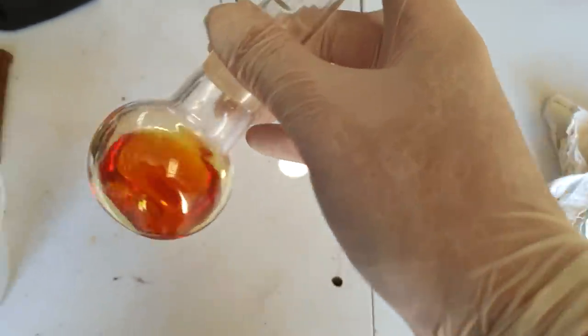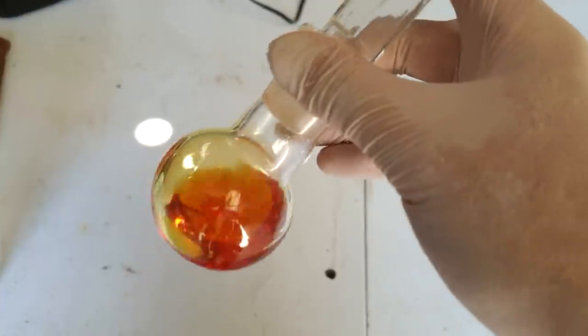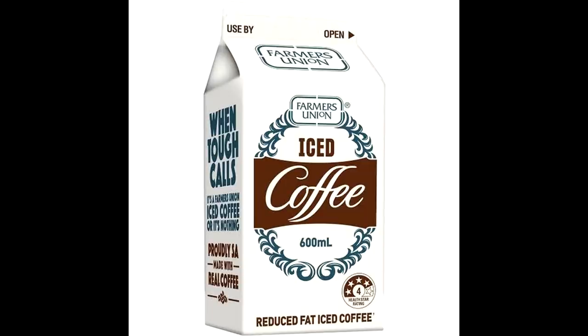The first method I'm going to try to get this to crystallize out is the lazy method. I'm just going to put this into the freezer overnight and see if it crystallizes out. Will this work? Probably not, but I'm tired and I need an iced coffee, so that's the method we're going to do. And if it doesn't work tomorrow when we come back, we'll try something else. But for now, let's just chuck it in the freezer and send it some thoughts and prayers.